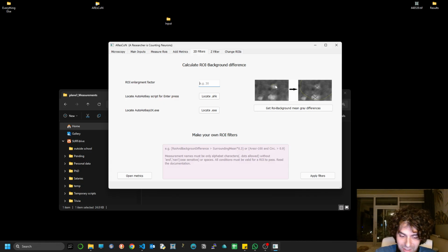Either you're studying the cytoplasm or nuclei, especially with nuclei, I would say, because with tomato I'm pretty much including every possible detection, but especially with nuclei, you really want to filter based on a background noise, right? And to do that, you really want to have as many observations at the first stage as possible.